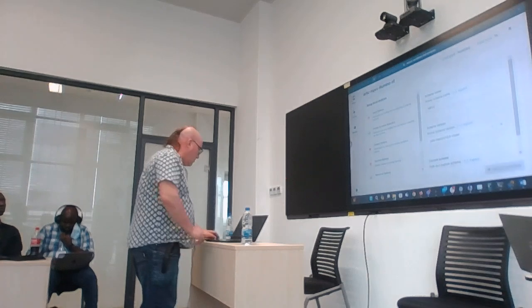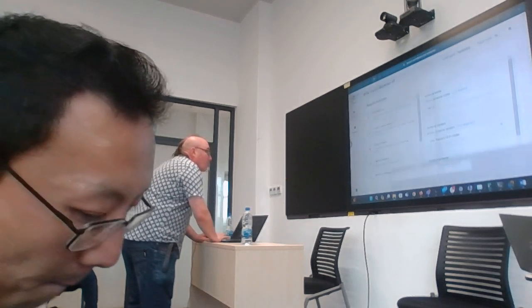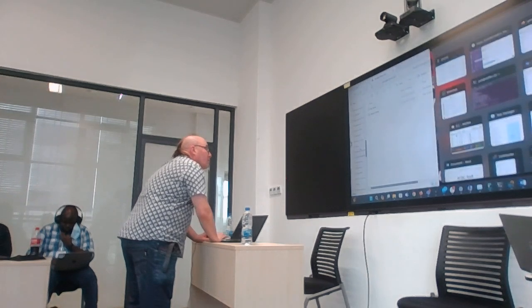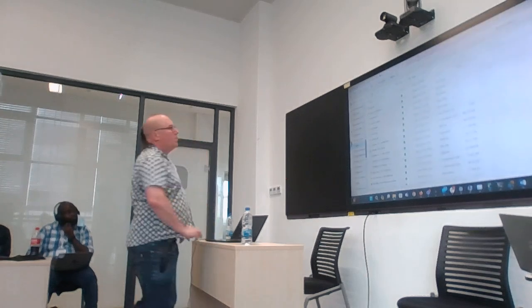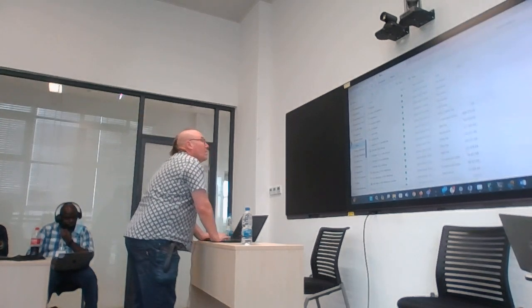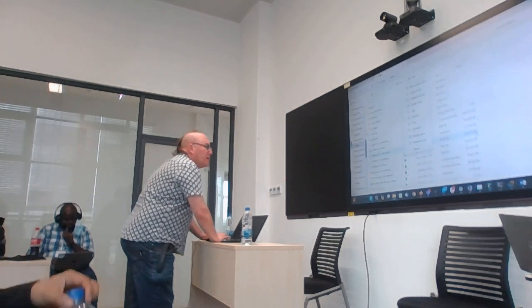Here's my data, let me see if I can make this bigger. Can you make the view bigger? Is there a way to make this bigger?